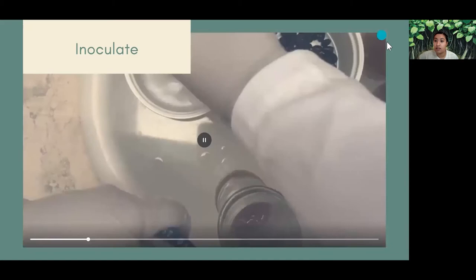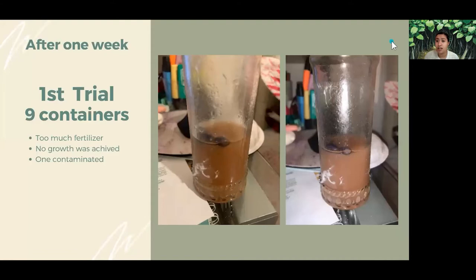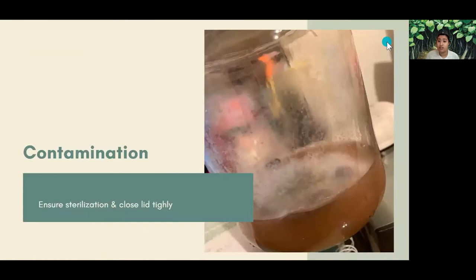Finally, for my results, in my first trial, I used a recipe that had too much fertilizer, so in 8 of the containers, no growth was achieved, and one of the containers didn't have the lid closed correctly, so it contaminated. So please be mindful of these little details.